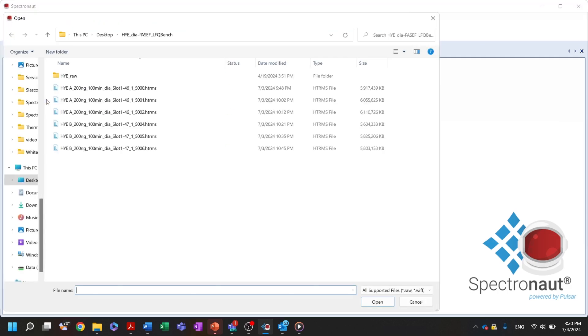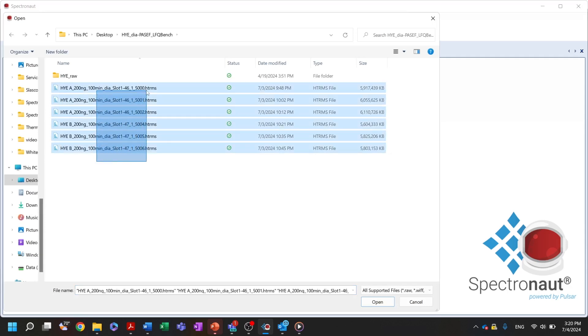We'll upload DIA data for direct DIA analysis. Today I will perform an analysis of mixed proteomic samples containing human, yeast and E. coli proteomes mixed at two different proportions.